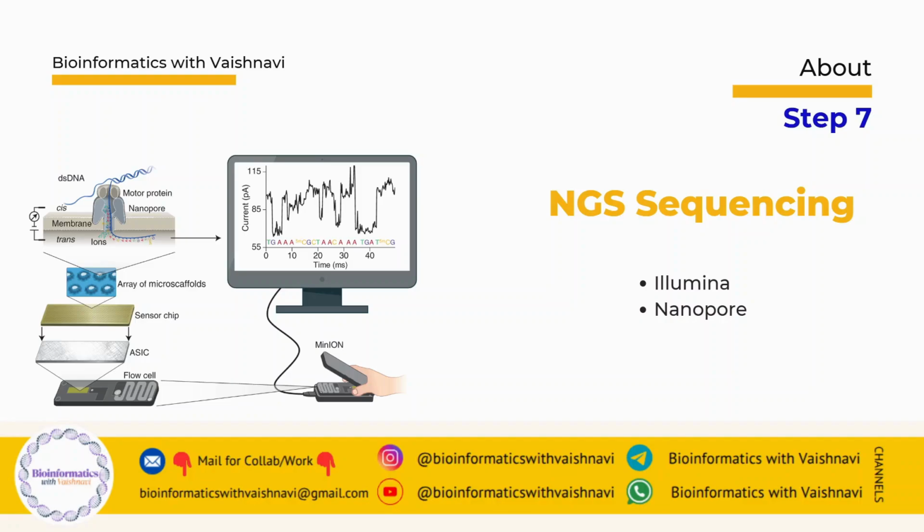So the next step is sequencing by NGS. Once the library is ready, it is loaded onto a sequencing machine. Common platforms include Illumina, Ion Torrent, PacBio, and Oxford Nanopore. The sequencing machine reads the DNA and generates raw sequencing data.